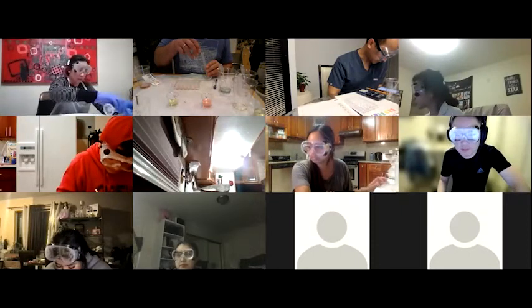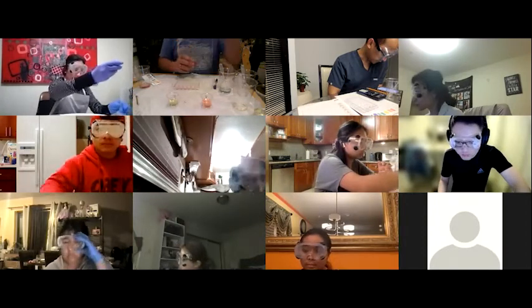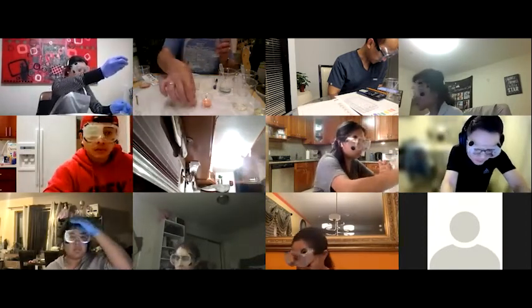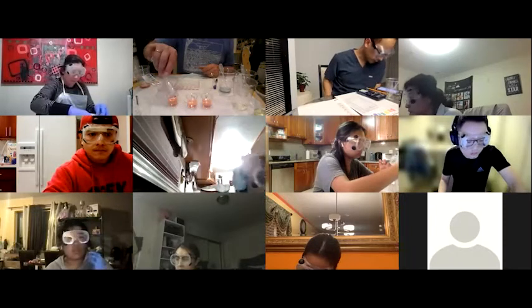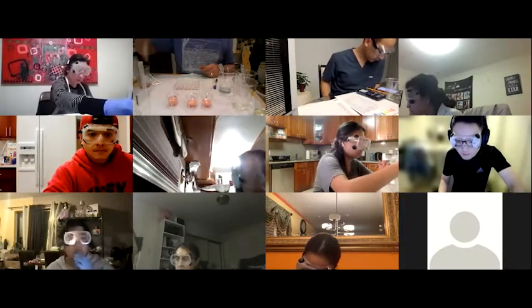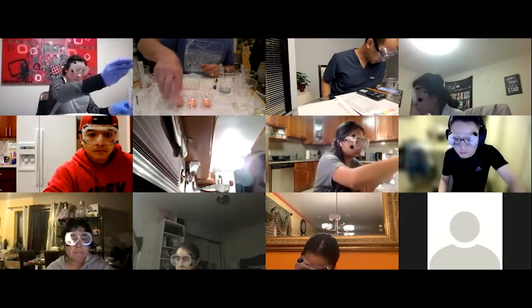So I mix this one up. Take 5 out of here, and add it to my third dilution, which turns pink again. So yeah, same color, which is what we would expect.